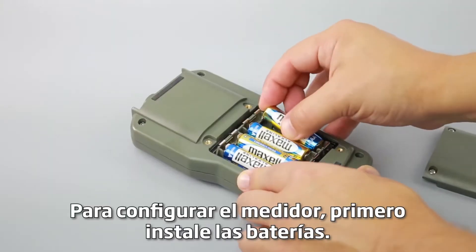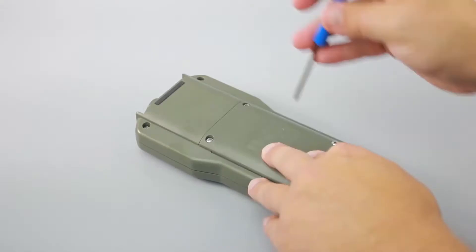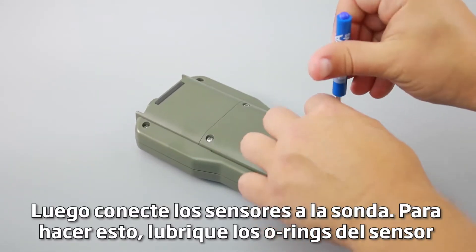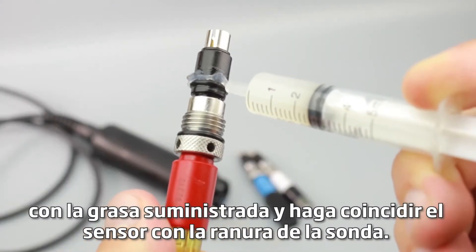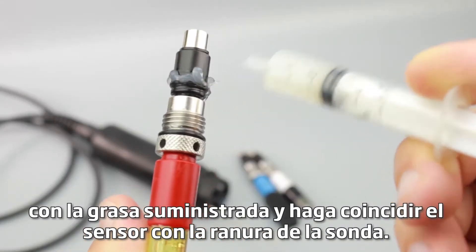To set up the meter, first install the batteries. Then connect the sensors to the probe. To do this, lubricate the sensor o-rings with the supplied grease and match the sensor to the probe slot.